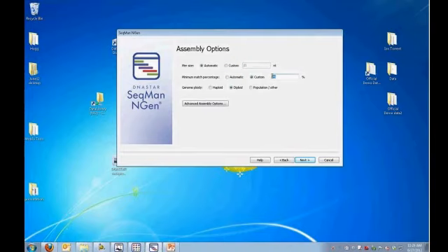So you can imagine if I lower this stringency to 80%, that will allow a lot more mismatch. For some data sets, you need to do that. If your reference isn't very close to your sequence strain, for instance, you can lower the stringency and get more of your reads to align. If you go too low, you start to get non-specific alignment, which can be bad. So typically, this is something that I will adjust and try higher or lower match percentages if I have a certain problem that I need to work out. The default of 93, we've optimized on hundreds of assemblies, and so it's a very nice starting point. But it is the one thing, if you want to change your assembly, that's the one parameter you look to first.